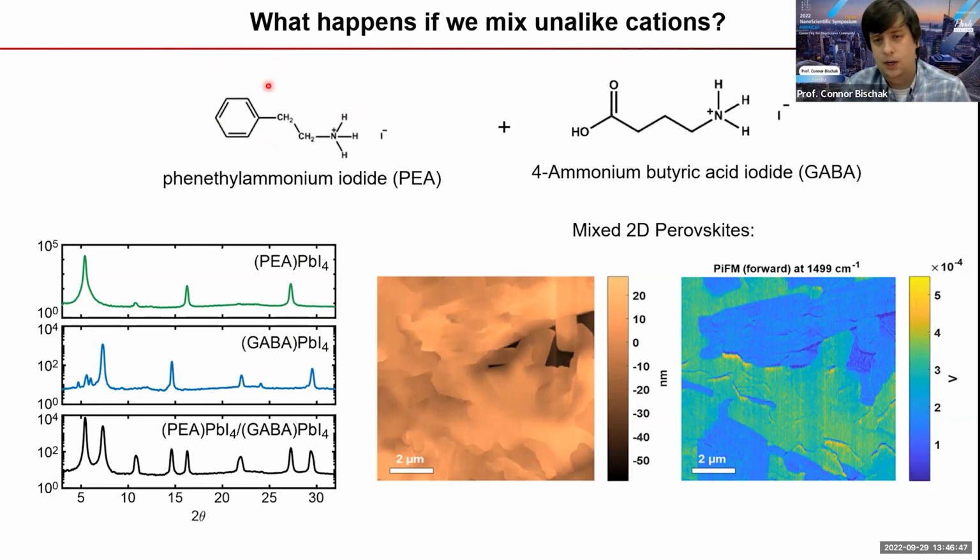And so what we're really excited to do now is essentially try to tune our properties so we can get different blends of these materials to potentially make things like solution processed heterostructures of these 2D materials.